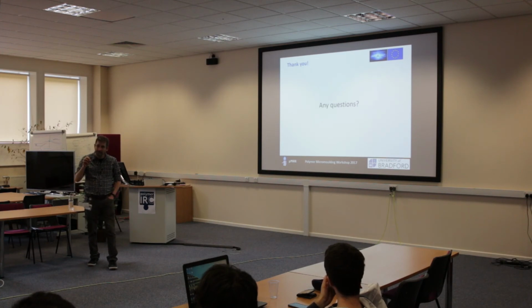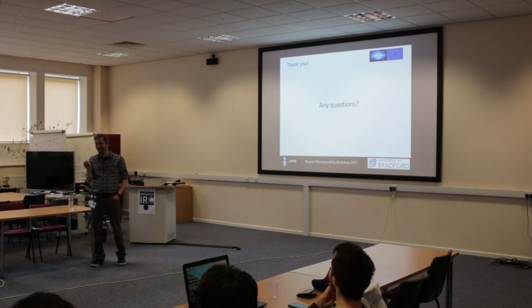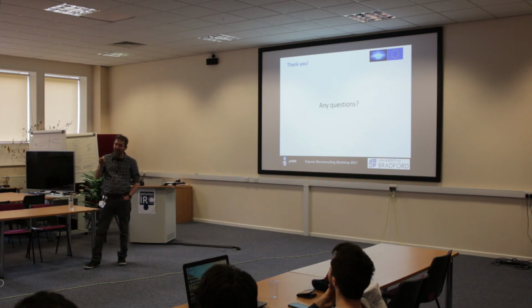But the problem is, if your parts aren't going to be angstroms, all right? If they are, then you're going to lose them, for a start. Your parts are going to be bigger than that. So you actually need a bulkier measurement than perhaps TEM can give you.